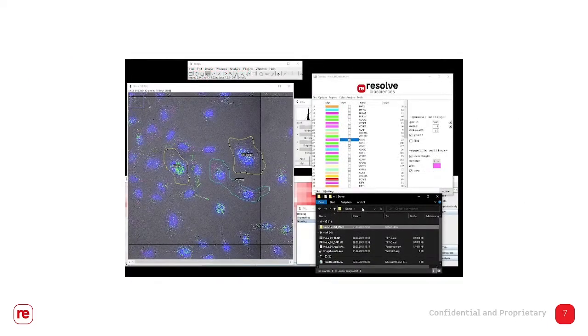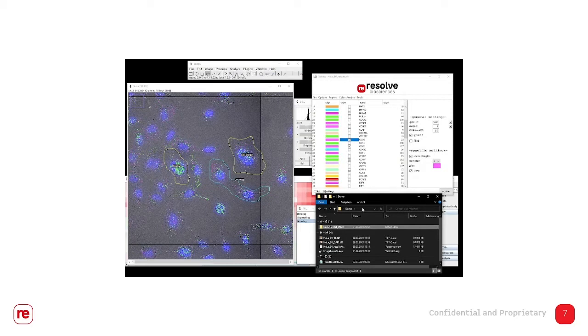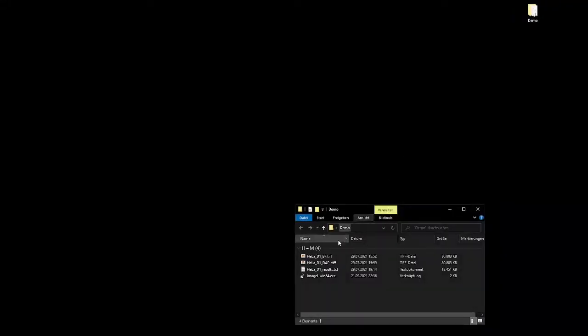And it's also easy to display and export gene expression by cluster in heat maps.